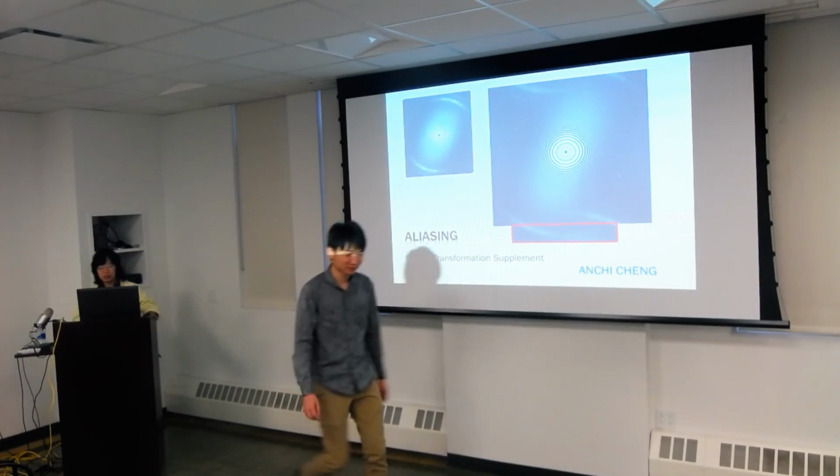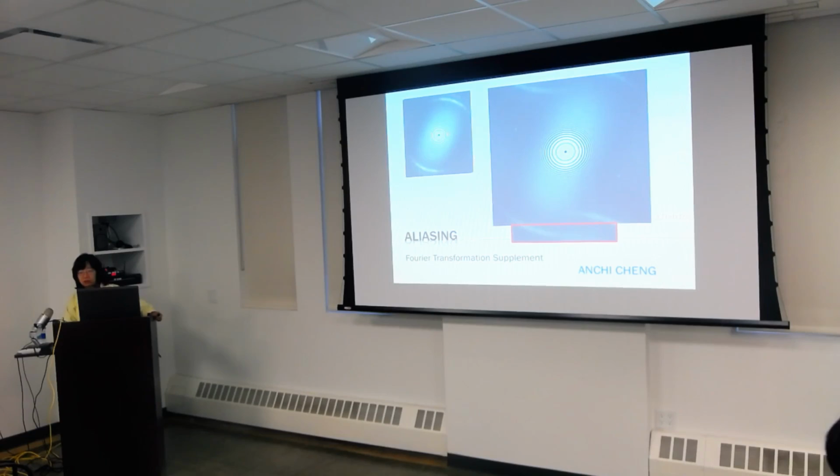Yes. So what I want to cover is something that Grant's lecture hasn't talked about that much, and it's a bit of an advanced topic in terms of Fourier transformation. But it will bring everything that you learned about Fourier transform together. There are places I will point you to, places that you can read about it. Once you start actually doing cryo-EM and start reading literature, then it will start to make more sense, and you will know where to look.